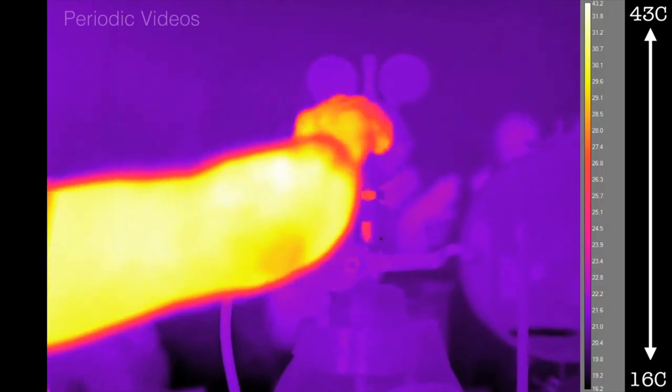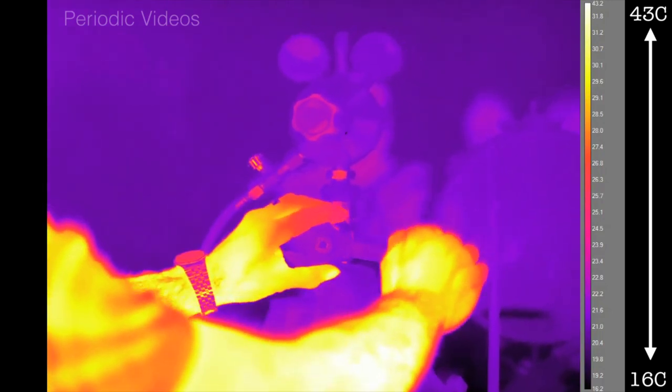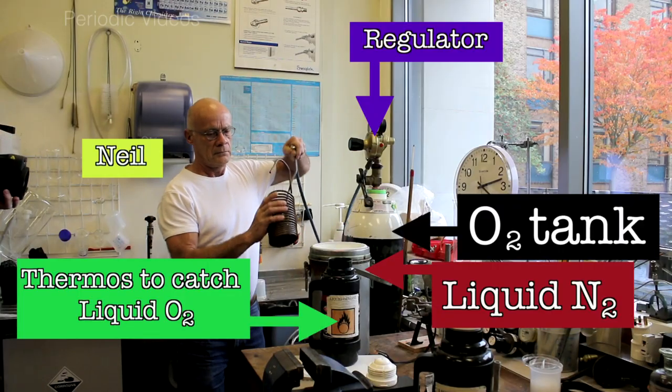You begin with a cylinder that's a high-pressure bottle of oxygen. Now, the pressure of the gas is far too high to use for the experiment, so you have to reduce the pressure with a so-called regulator, which sits on the top of the cylinder. Once you've got it flowing, you flow it through a coil of copper. Copper conducts heat very well, so if you put the coil of copper in the liquid nitrogen and flow the oxygen through, it will liquefy.